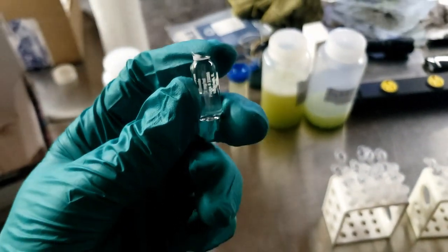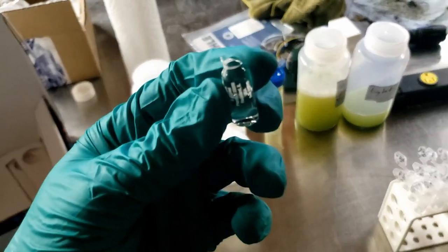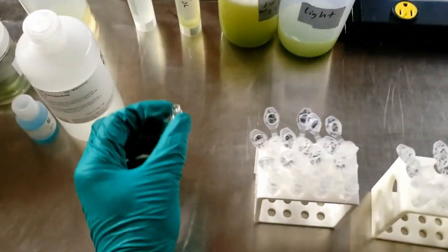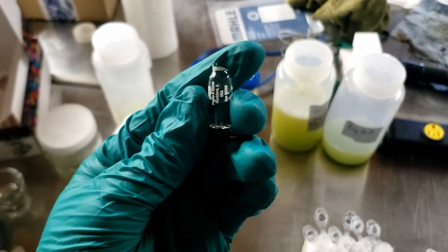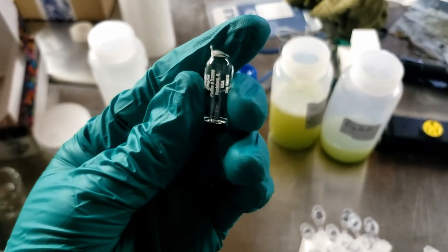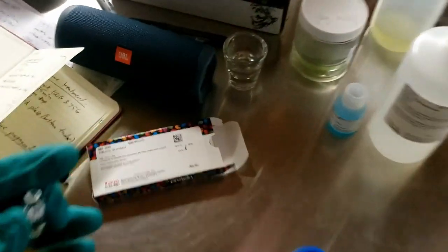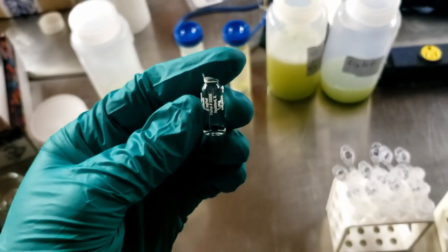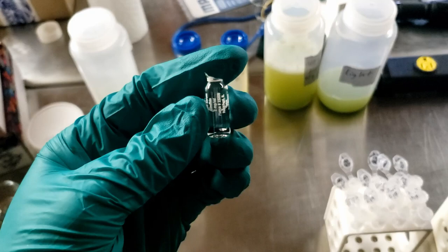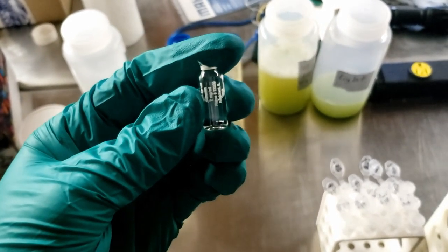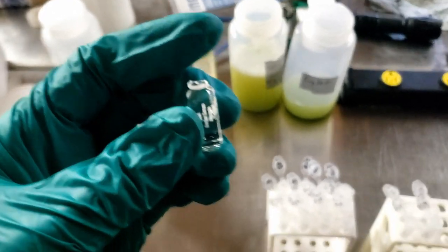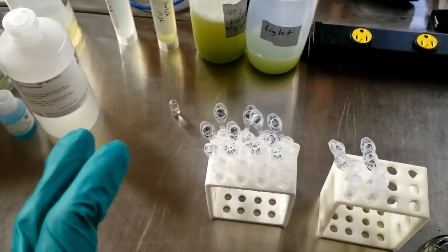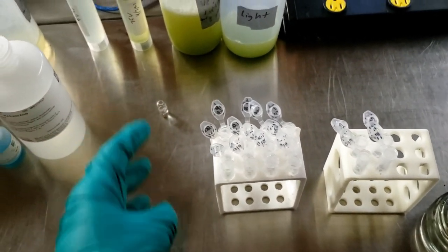So here's the glass ampule. This is a whole milliliter. When I do these assays, I only end up needing about 200 microliters from this in order to make all the standards. You can put this in a new test tube and close it and save it for later. It does not need to be stored in the refrigerator. Right there it says store between 15 and 30 degrees C, that's room temperature. I wouldn't recommend keeping this around for too long. If you're going to do an assay the next day or maybe even within the week, then you can save this. But I have a feeling it degrades after a certain amount of time. If you plan on storing it for a long period of time, maybe look up how long it takes to expire once the ampule is broken.